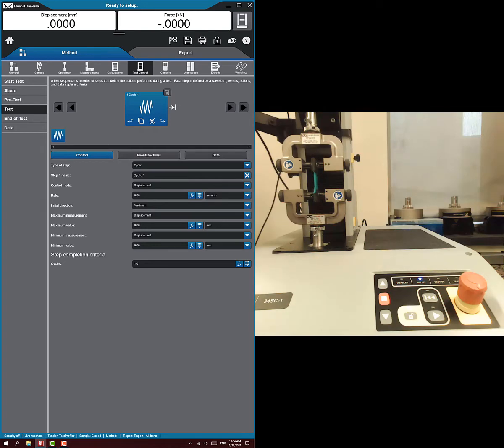We're going to do it on displacement and set a displacement rate — I've been using 25 for these videos, so I'll use 25 again. Then it wants to know how far to pull, the max distance. I'll pull to 12.5, so it should take 30 seconds to get there. Then it wants the min — picture a waveform going up to 12.5 and back down to zero, so our min stays at zero. We just want to set it for one cycle, not twice.